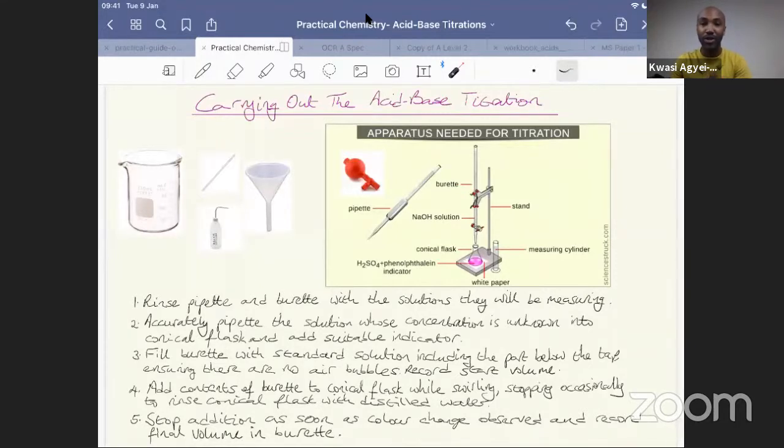So that you've got sodium hydroxide neutralizing a significant amount of your weak acid when you want it to be neutralizing your sulfuric acid. Okay, so we've got our indicator ready. We've got our burette filled with our sodium hydroxide. What we're going to do now is to add our sodium hydroxide to the contents of our conical flask.